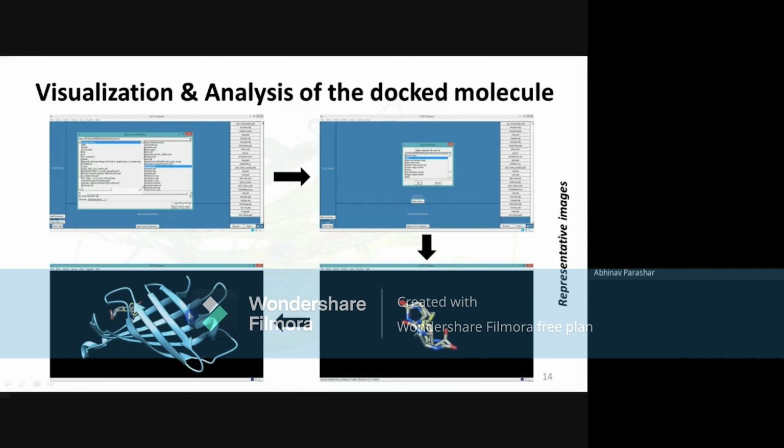Now, in here we are trying to just see. Look, all the three are there. I have not removed anything from there. And there is this protein structure, and this is the biotin molecule. And this is the location where it is binding. What are the amino acids which are making a hydrogen bond with this? All those things we are going to see when we do docking.